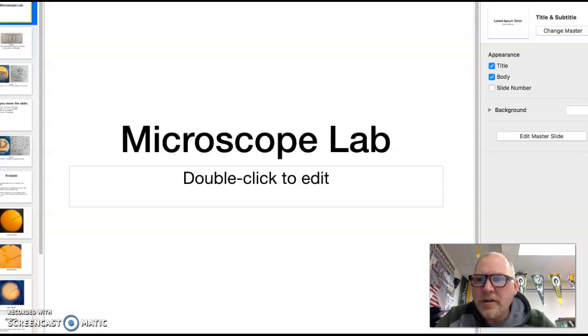It's me, Mr. Stark. Today it is Monday, and last week we ran through the Microscope Lab where you had to look at the letter E, some of your cheek cells, and the onion under varying magnifications using the microscope. I put together a little slideshow to show you what you should have seen, what I was hoping you would be looking at.